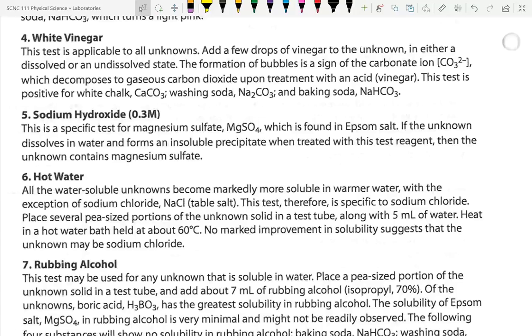So that goes back to the solubility. You need to note how much you have when you start. So if you're checking to see if it dissolved, you'll probably still have some at the bottom. But if there's only half as much as I started, then half of it dissolved. So the solubility is something you're going to be testing, and it's not going to completely dissolve probably. So you have to make sure you know how much you started with, which I didn't check. When I did the first one, I wasn't very careful on that. So it was not definitive. You can't say, oh, well, he already did sample 7 with water solubility, because I didn't do it right, because I didn't check carefully.